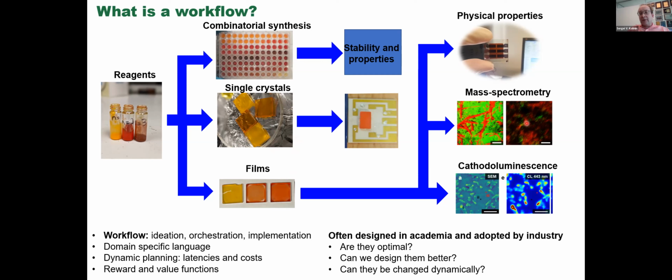The same type of feedback comes from the imaging experiment. Ultimately, I'm doing the mass spectrometry measurements, or cathodoluminescence measurements, or SPM measurements, not just for fun, but with the idea to learn some information about the material and optimize either the manufacturing part or perform the selection of individual reagents. So basically, once we talk about lab workflows, we deal with a characteristic stochastic optimization problem. And this is where machine learning theoretically can help. But in order to do that, we need to have the right machine learning tools. And we also need to formulate the everyday discovery problem in terms that machine learning can actually approach.